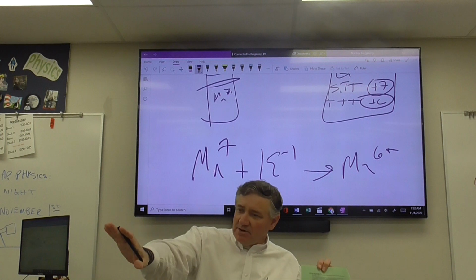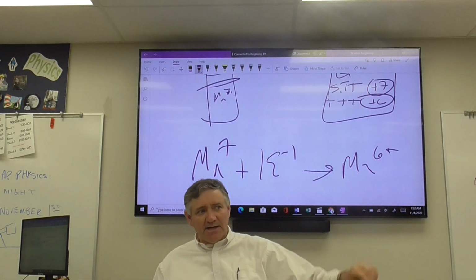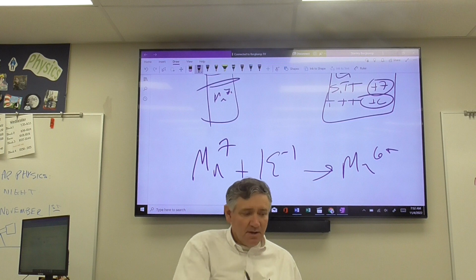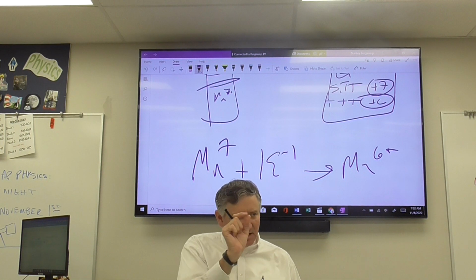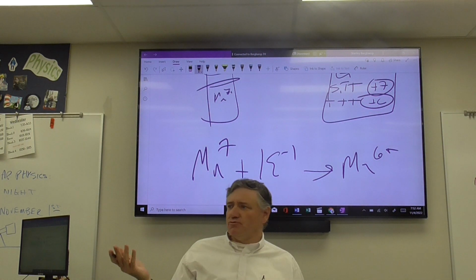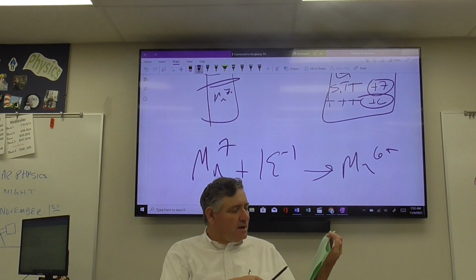Here's the difference in how I wrote this lab. Notice with the potassium permanganate, I said you need 0.10 grams. You need exactly that value. This one I said you need about 2 grams. Potassium hydroxide pellets look kind of like BBs, it's a bigger pellet. That's why it's tough to get an exact amount. So get something around 2 grams, 2.1, 1.99, something like that.